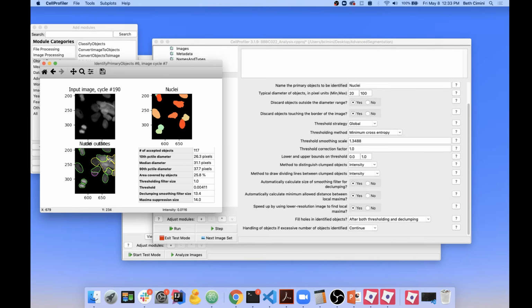The one thing that we have over here is this big clump of nuclei, which I'm going to choose to allow the program to just keep all together so that they're thrown away, because these are hard to segment. But if it were important to you to actually be able to get every nucleus, of course you would want to try to fix this. How would you fix it?